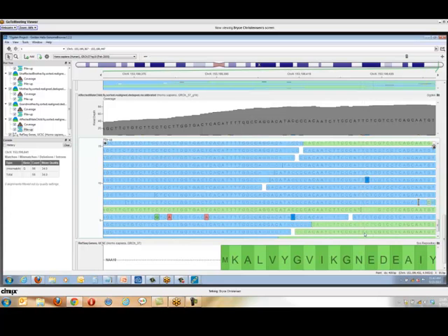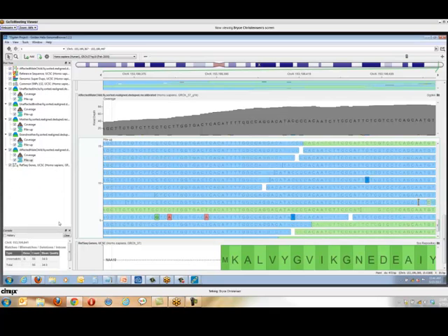Yeah? So, where is the annotation database located? Everything that I'm doing today, right now, is on this laptop. So if we purchase the software, all the databases are locally installed? If you were to get the software, let me point something out.